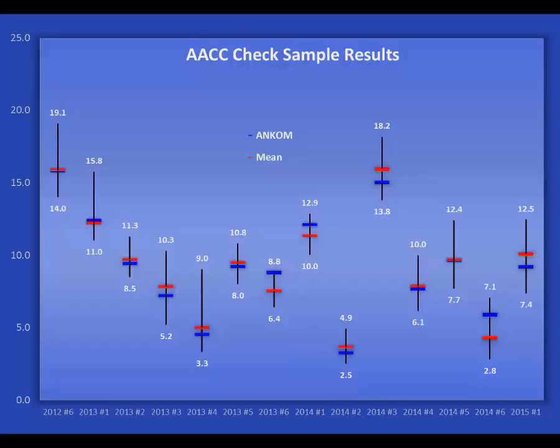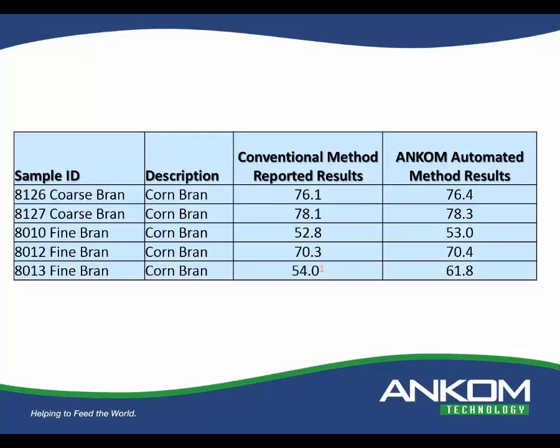So that average can be deceiving. You can't say the average means that's the best number, but it just gives you an idea of where all the laboratories are lined up and how we relate to those check sample programs. I think perhaps a better result to look at is this corn bran.